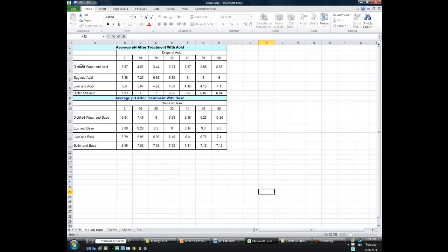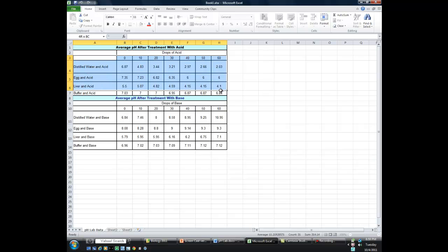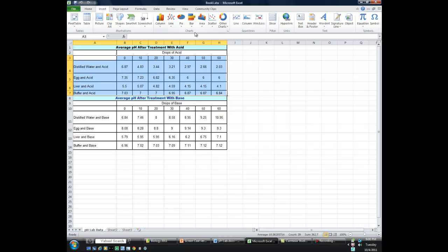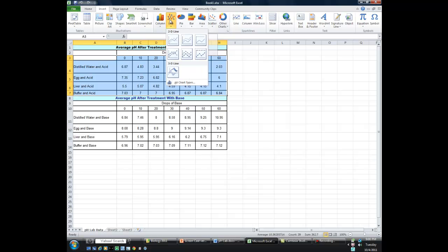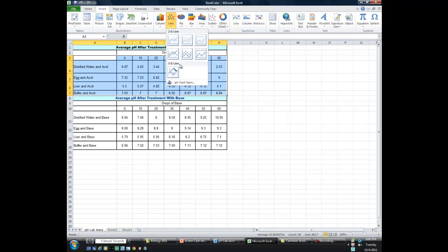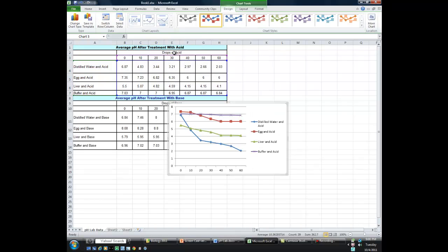So I'm going to go back to Excel and look at the effect of adding acid to four solutions. Here are the four solutions: distilled water, egg, liver, and buffer — and this was adding acid to them. I'm going to highlight the data I want to include, then go up to the menu across the top, go to the Insert tab, and select Insert Chart, Line Chart. I'm going to select a 2D chart with markers. And you'll see that you get a very basic line chart that way.